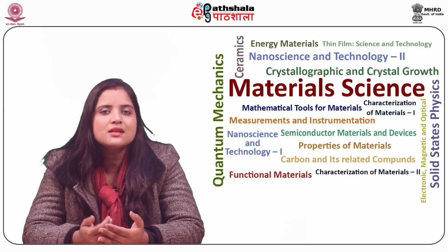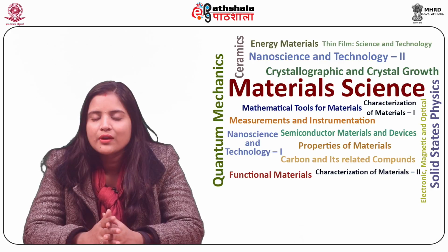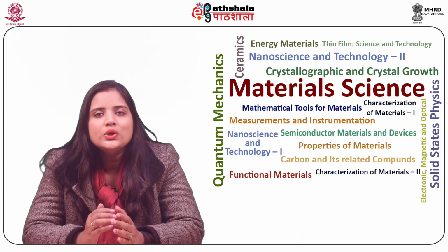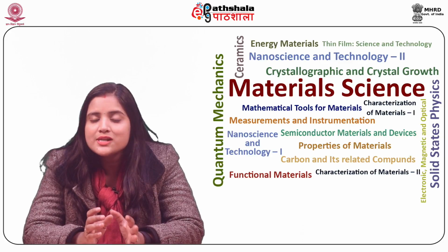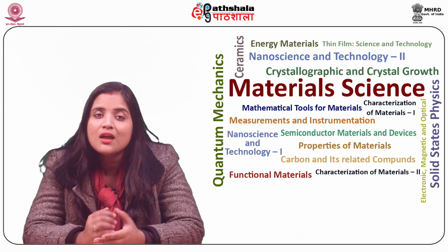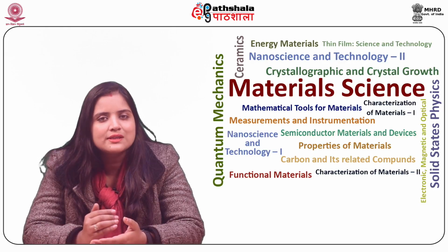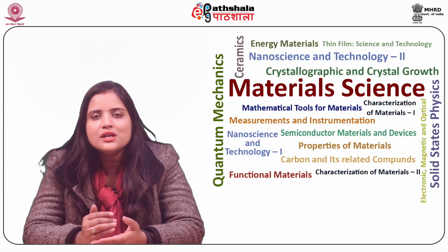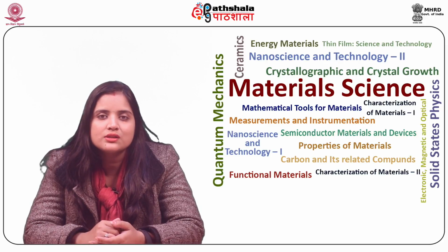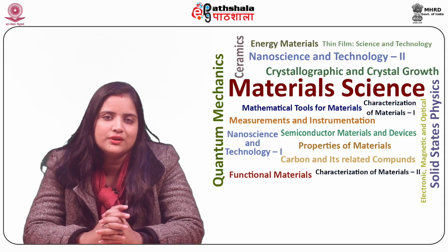We will next discuss the data collection, results, and presentation. Semi-quantitative EDS analysis is utilized for identifying diverse elements which might be existing in an unknown sample. WDS examination is primarily involved in the case where composition analysis of an unknown phase is done quantitatively.